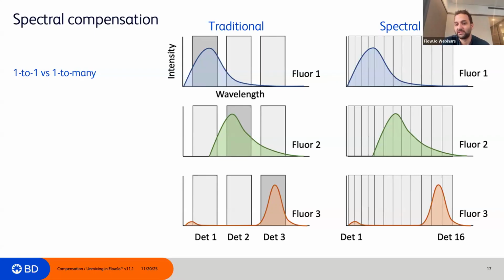Ideally you would do a test. I would do this in cases where I do not have a very good panel and I have a lot of spectral spillover to secondary channels, and the compensation matrix is really bad. Then I would consider leaving all detectors in and see if this improves the resolution a little bit.